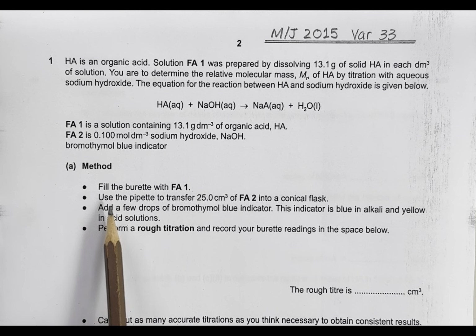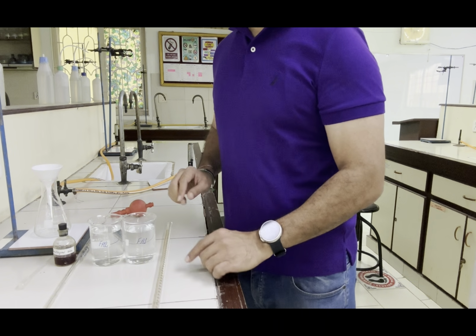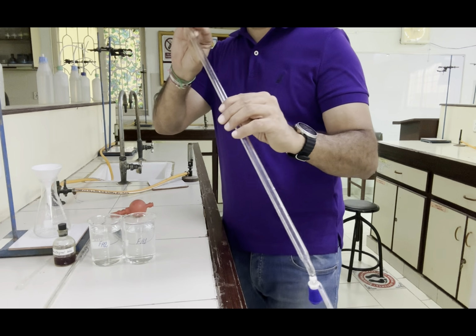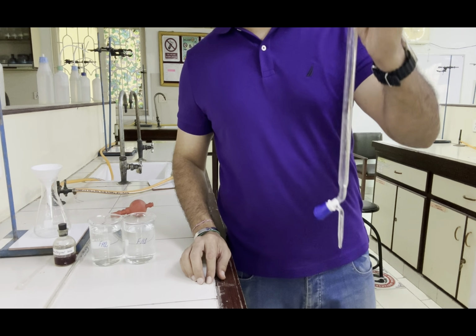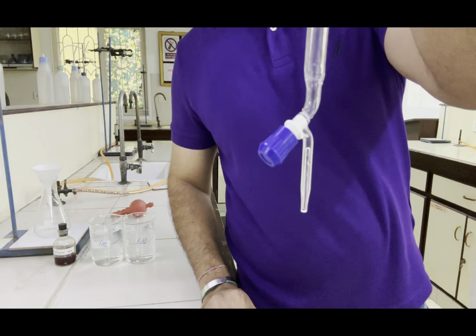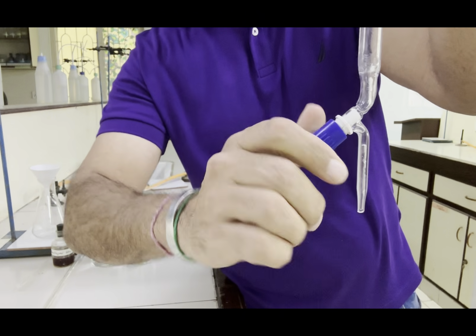Method says fill the burette with FA1. So let's fill the burette first. Now fill the burette with FA1. To fill this burette, we need to close this knob first by twisting it clockwise.